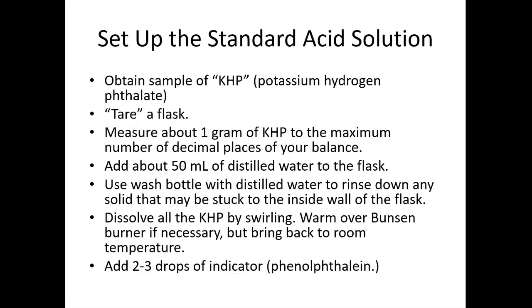We're going to come back to this slide later on. We're going to be obtaining a sample of potassium hydrogen phthalate. Notice that we abbreviate it as KHP, but KHP is not a formula. It's not potassium hydrogen phosphorus. No, it's potassium hydrogen phthalate.